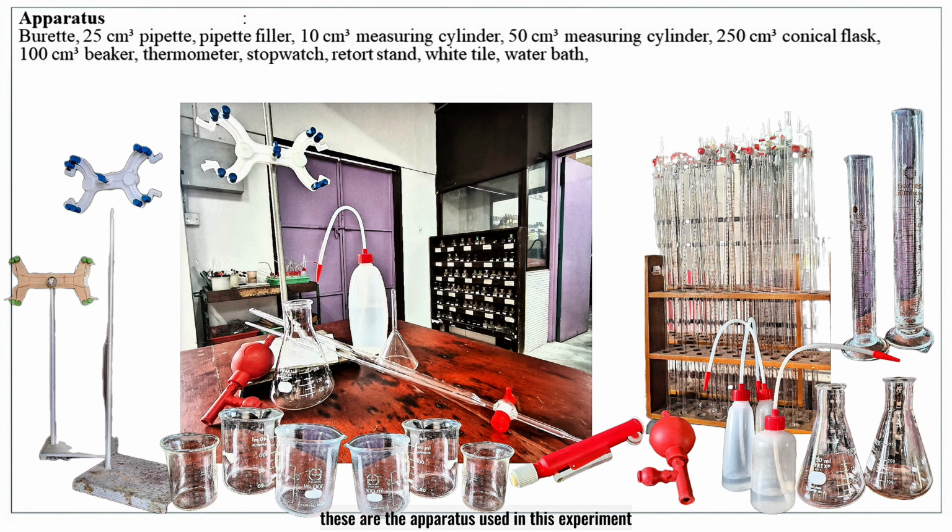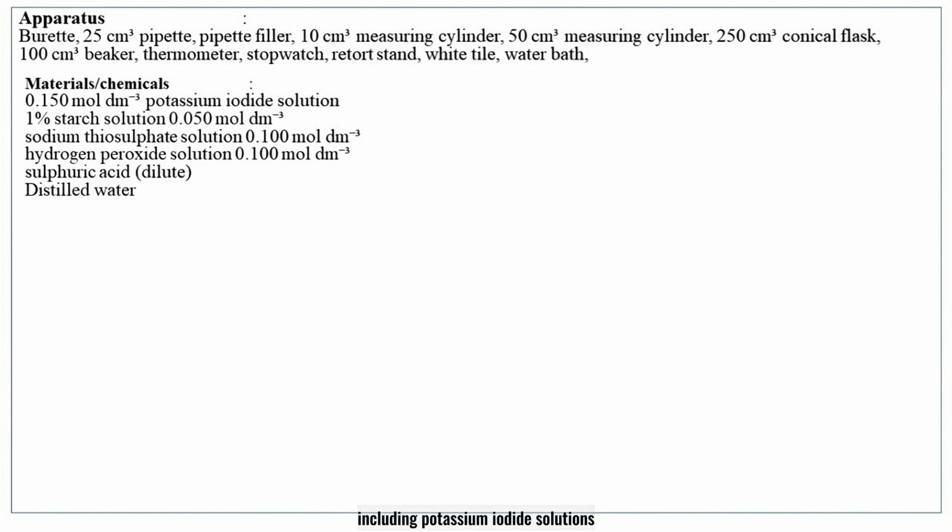These are the apparatus used in this experiment, while the chemicals include potassium iodide solution, starch solution, sodium thiosulfate solution, hydrogen peroxide solution, and sulfuric acid.